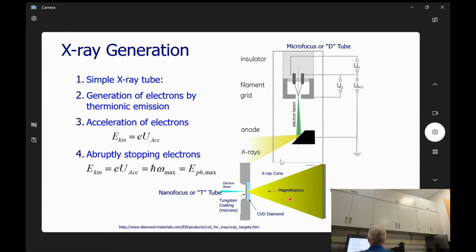This is what we're going to try to use for anything that we need to do true grayscale analysis. It's not going to be as good as a medical CT, because in a medical CT, we're only going to have a few widths of pixels in the middle, and those are going to rotate around. But in this one, it's going to be worse because my energy spectrum of this side is not going to be the same as this side.